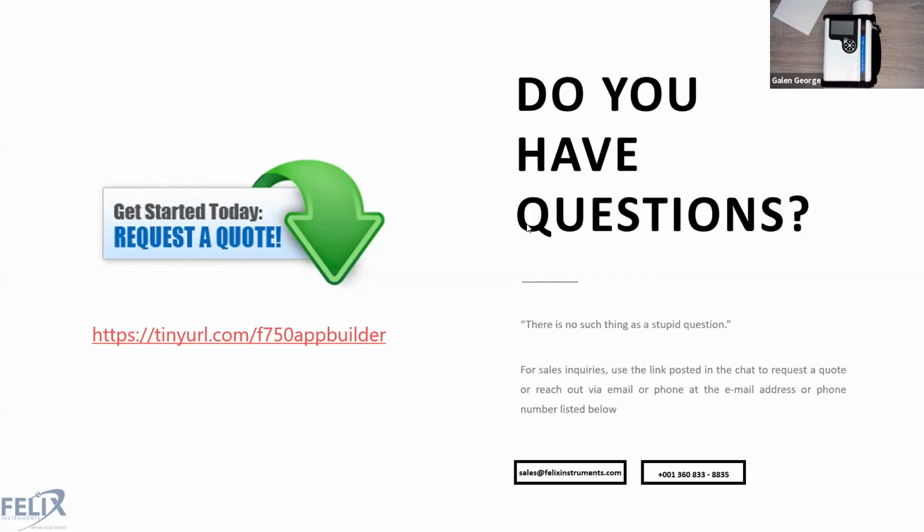It is a leaf spectrometer, but the form factor of it would be more appropriate for doing the agave testing because it utilizes a clamp on the top, so you can actually clamp the agave. It might be easier, but then again, I think we might want to have a chat to make sure the instruments are going to be appropriate for what you actually want to analyze.